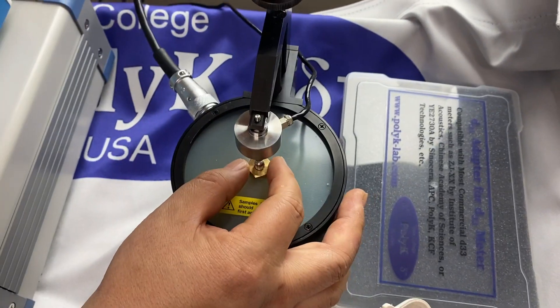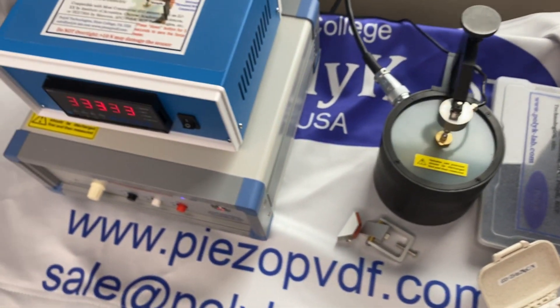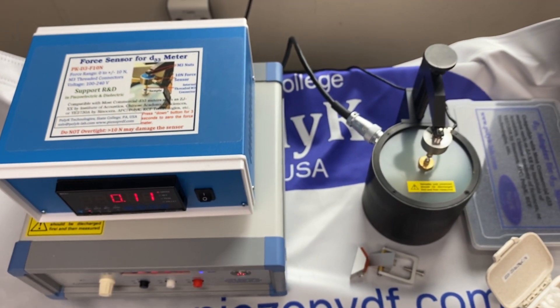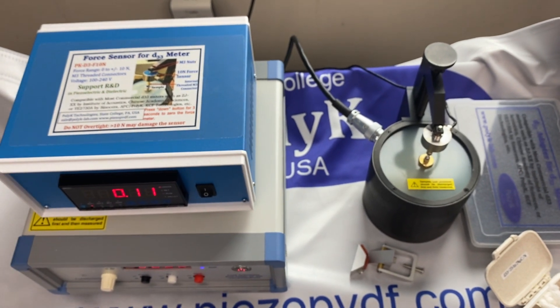When you look at the sample over here, there is a force applied. In the old days, it was difficult to control it. But with this meter, you can read the force — either 1 newton, 0 newton, or up to 10 newton.